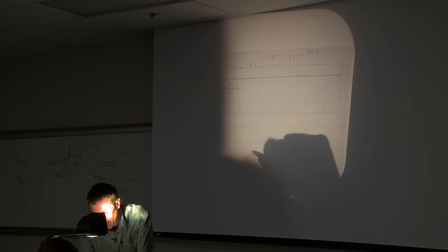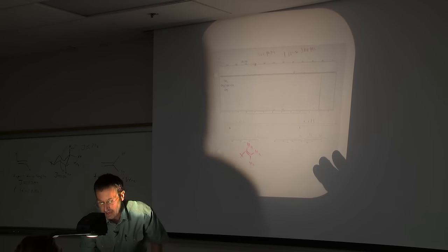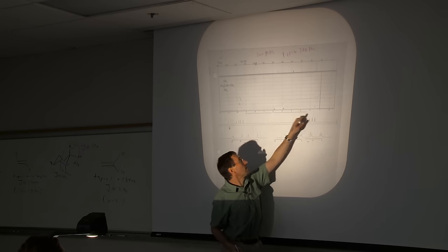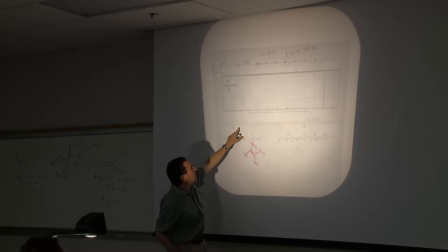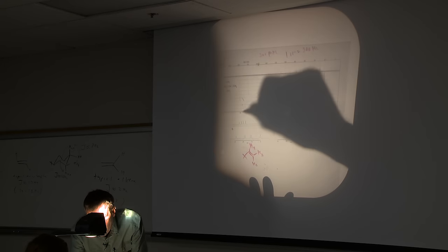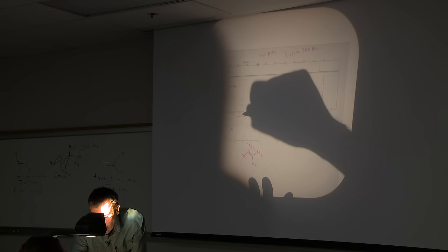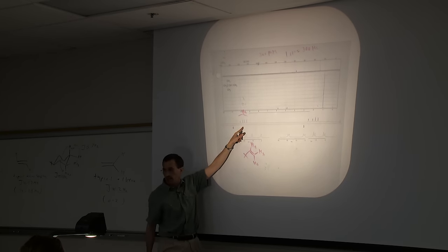And that's just what I had up on the blackboard, our spectrum of 3,3-dimethyl-1-butene. Except now, instead of looking at a prediction, we're looking at real data. So you've got your tert-butyl group over here, and then you've got your alkene region over here. And I expanded that alkene region from about 5 to 6 over here. And you can start to see your doublet of doublets. In fact, you can see a doublet of doublets over here, and that corresponds to HC. That looks essentially like the pattern I drew on the blackboard.